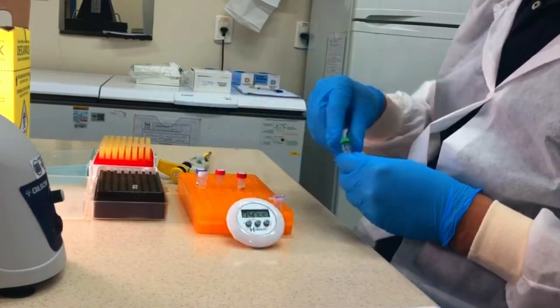As you could see, the protocol has basically only four steps: amplification, amplicon quantitation, barcodes, and rapid adapter. It is simple and easy. The barcode mix is ready for use — no need to prepare a mix, just add the barcodes into the DNA sample, two minutes on the thermal cycler, and it is done. For the rapid adapter, you just need to add it to the library and five minutes of incubation.